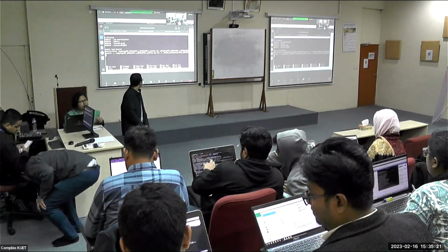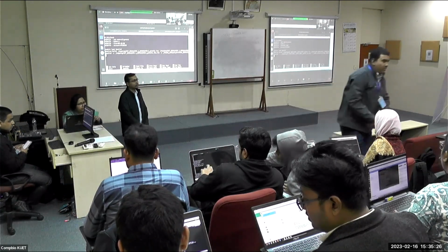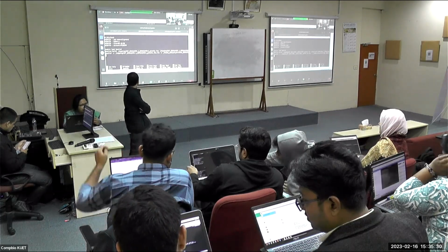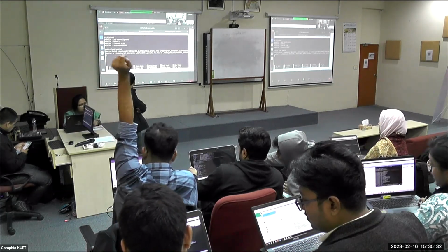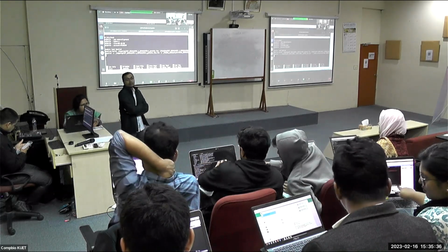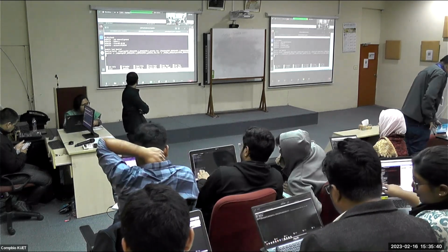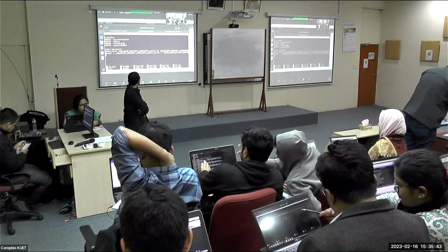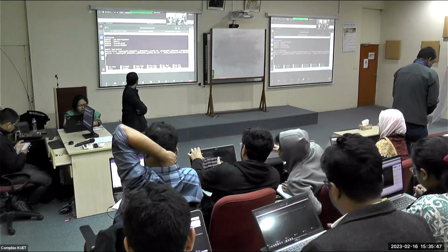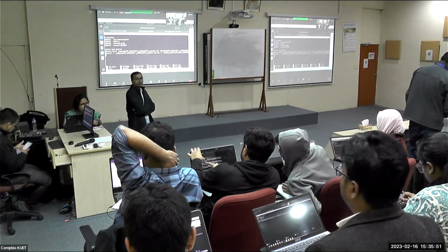So actually this is a kind of batch command mode, because we are giving the computer two commands, actually three commands together. The first one is module load. We are asking it to load the module. Then in building the index, bowtie2-build, and then bowtie2 align. That's the alignment of the reference file with the first fastq files.